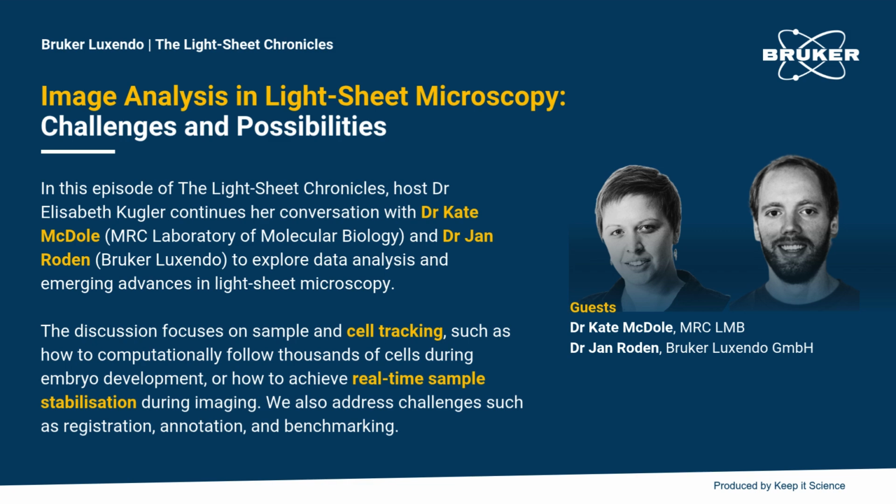For example, if you do a tiled acquisition, whenever you move the stage, depending on what kind of sample it is and how it is mounted, it can move a bit or wobble a bit. So this movement you need to compensate with the registration, but also optical distortions, right? Especially if you image from orthogonal views, for example, in a multi-view microscope, there can be optical distortions.